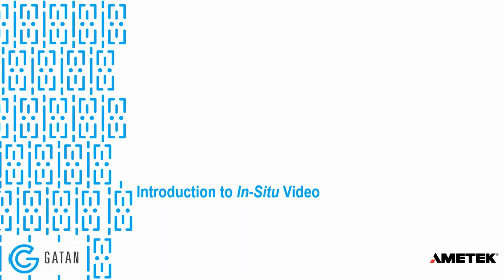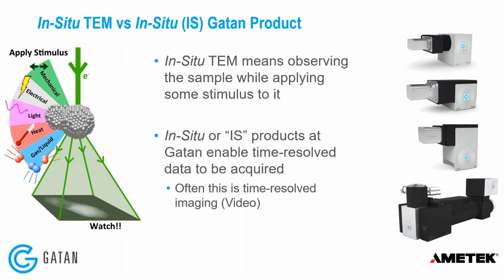So I'm really excited to present about this topic today, about in-situ video and how to process in-situ data in GMS. And first, I want to just start with a brief introduction to in-situ video and what this means in the context of in-situ TEM.